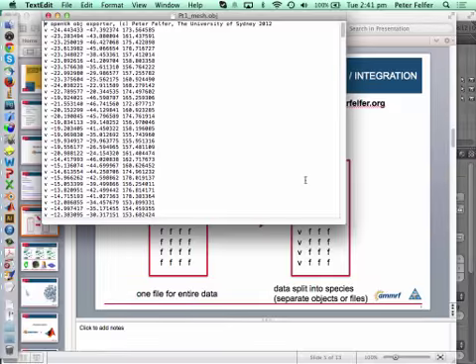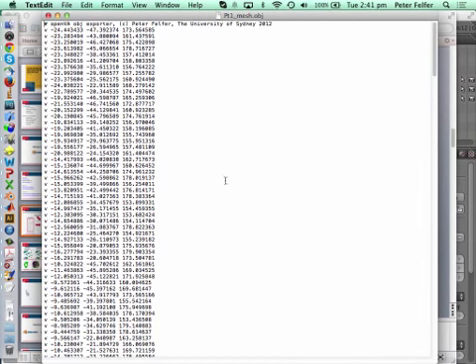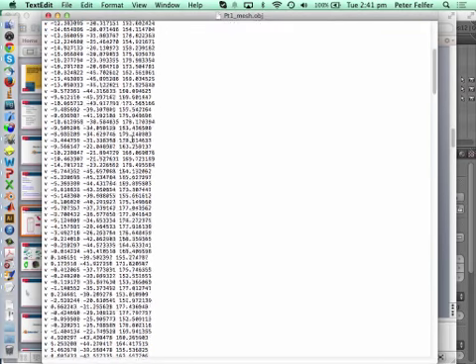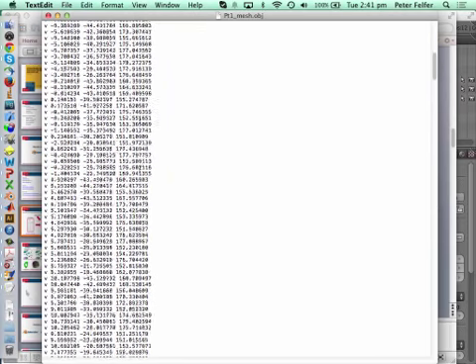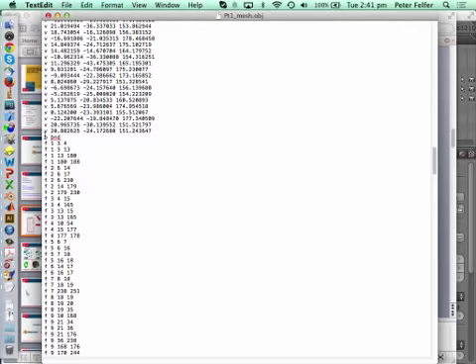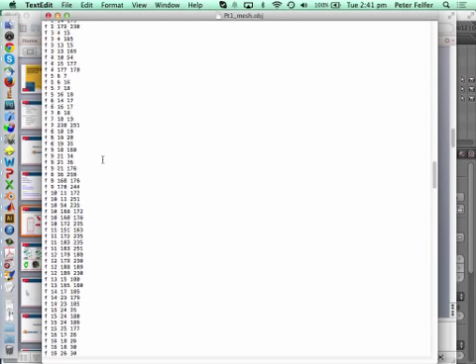So that's an OBJ that's created by one of my exporters, and you can see it's just the different vertices of the mesh here, and eventually you get a list of triangles. And for all of the files that we're going to use, there needs to be an O between the V's and the F's. What that means is it designates that there's an object coming. That's not actually something that's specified in the file specification, but in all the files that we're going to use, it needs to be there, because otherwise the programs will get confused.